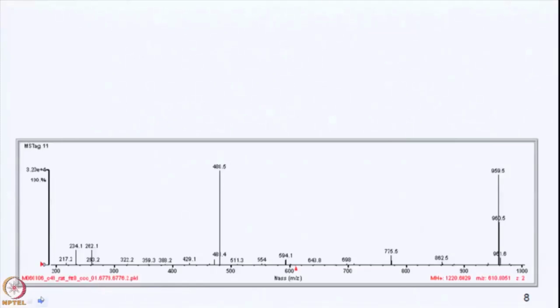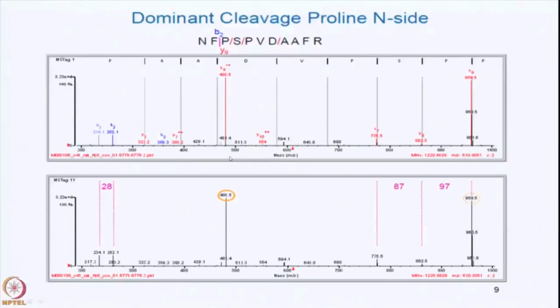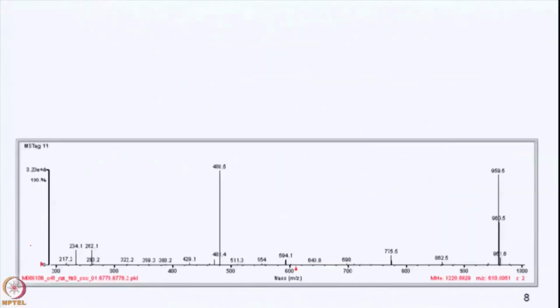All right. So let's go to the next one. Okay. So this one is going to be easy because there's not very much to work with. All right. So you take a look at the spectrum. There is not a lot of symmetry. But there is, if you look at this, this is doubly charged.